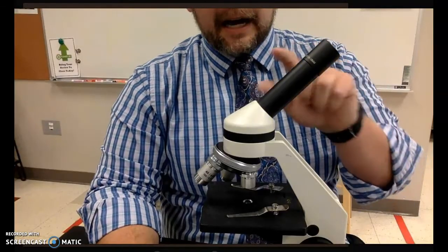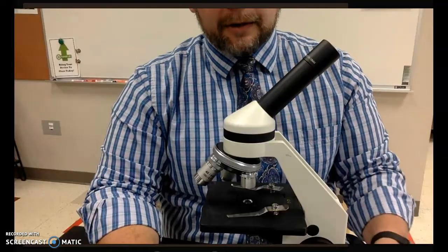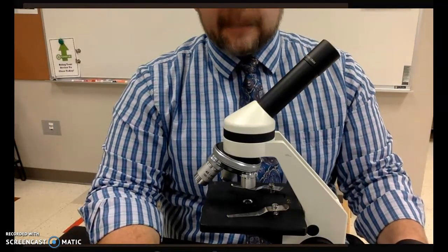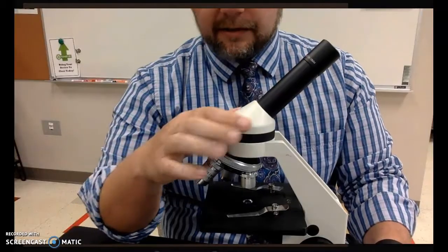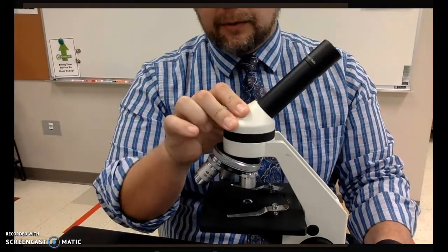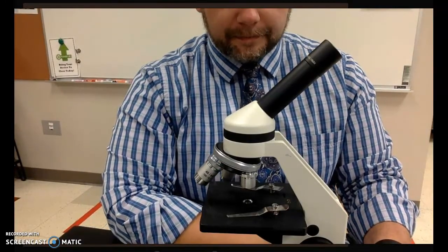Moving down from the eyepiece, we have what is called the body tube. The body tube of the microscope simply just creates space between the eyepiece and the next part of the microscope. Not labeled on your diagram, up here, there is a series of mirrors below the body tube and the eyepiece, which will reflect and magnify within the microscope as well.